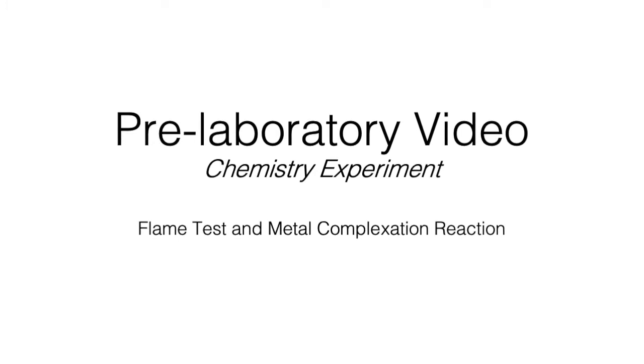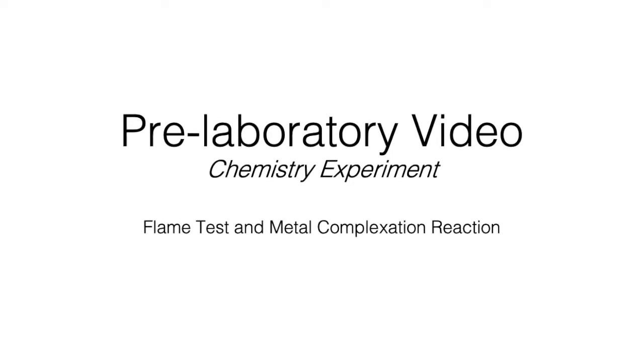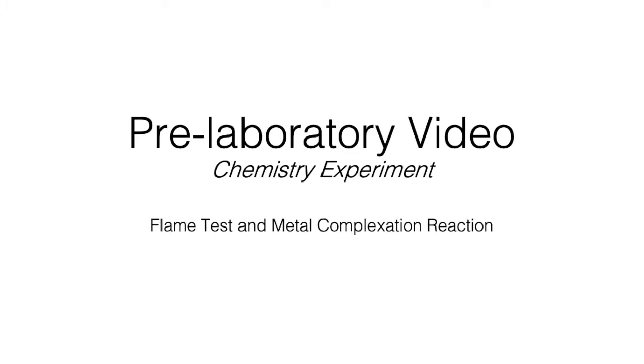This experiment involves two parts, which should be familiar. We have a simple flame test of lithium, sodium, and potassium ions, followed by a metal complexation reaction demonstrating a few colored cobalt-2 complexes. These experiments may seem very simple, but your aim is to use the concepts learned from the previous experiment while carrying these out.